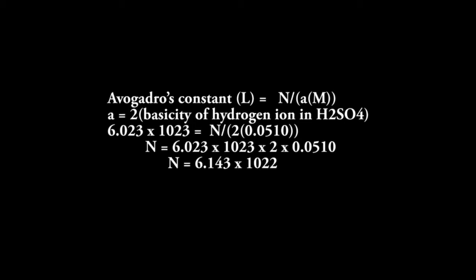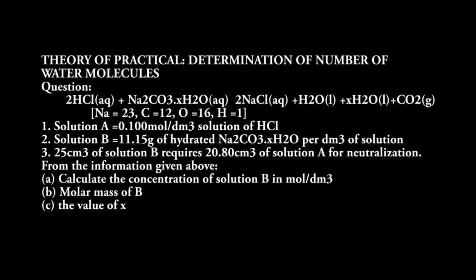Determination of number of water molecules in a substance.